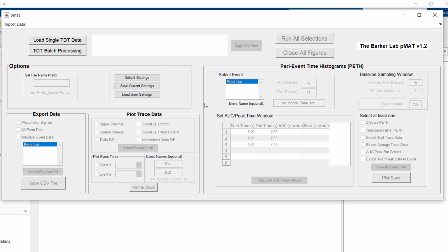And also remember, at the GitHub link that we showed you here, there's sample data. So if you don't have your own data collected, or you just want to make certain that you're getting everything right using data that we've provided for you, feel free to use that sample data to your full advantage.